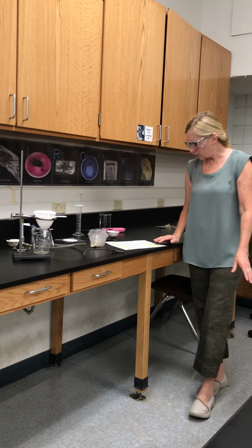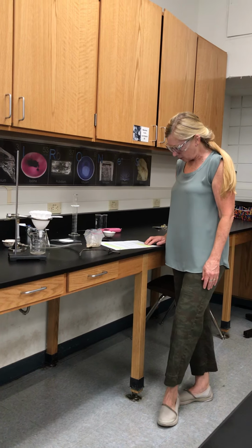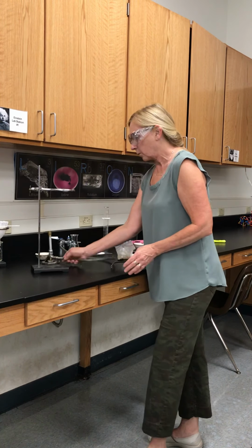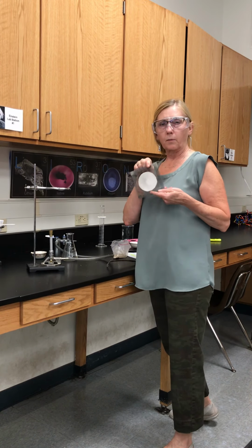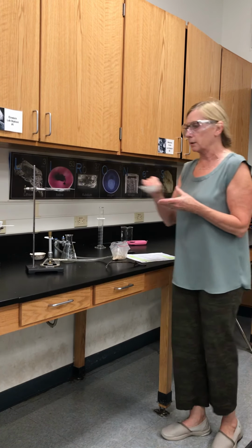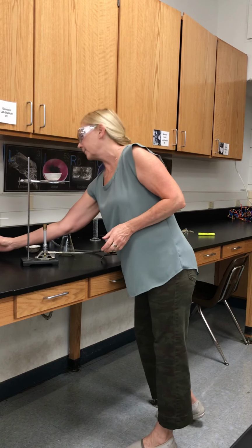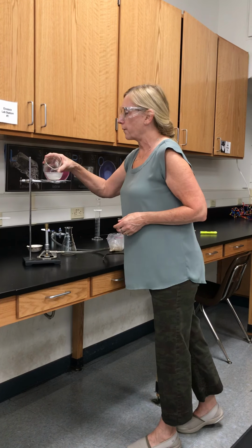What we're doing is catching the filtrate. This is called the filtrate, which is coming into the beaker. We've caught that into our beaker. Then I'm going to switch ring stands because we need a different height here, and we're going to get our Bunsen burner ready. We're going to place the wire mesh screen on top, and take the evaporating dish and put it on there so that it doesn't fall through. Then we're going to take our filtrate, the liquid that we collected, and pour it into the evaporating dish.